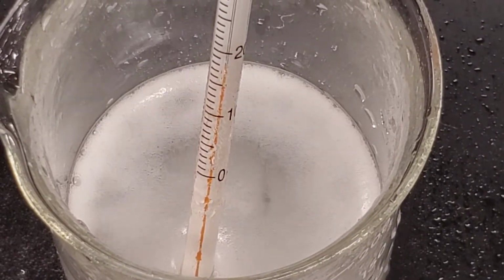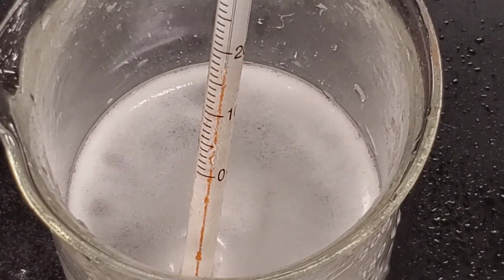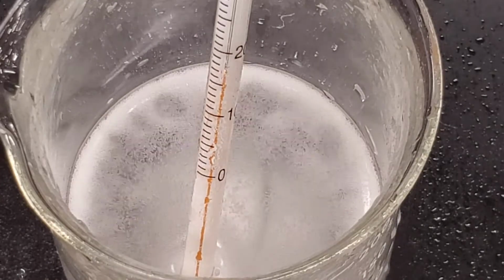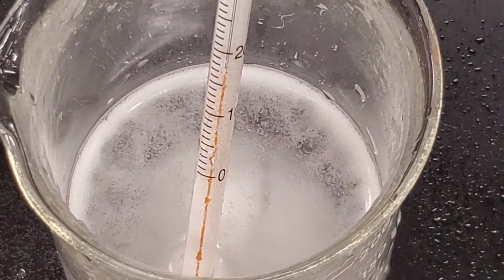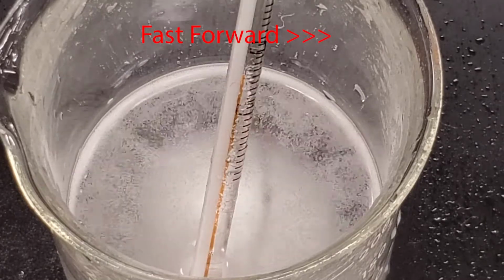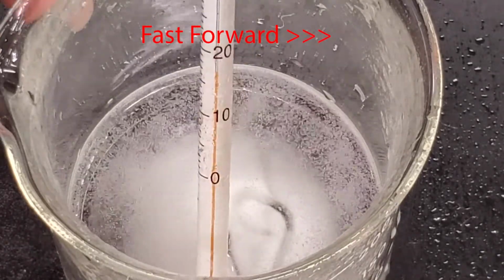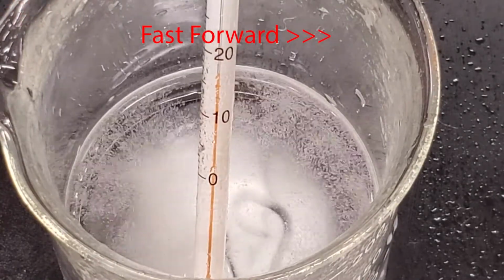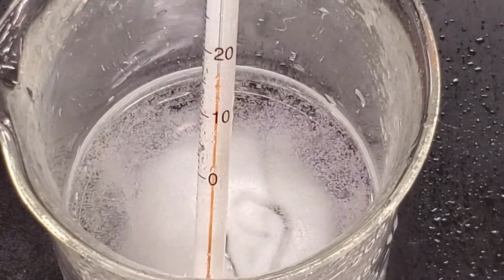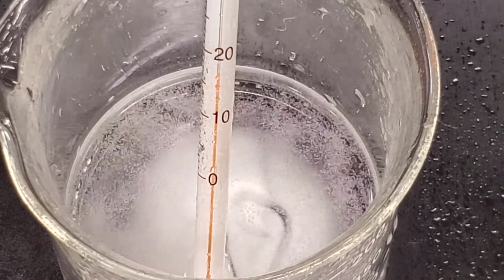Make sure you're paying attention to any reactions or changes that have happened and that you're recording those into your table 1 next to the baking soda and vinegar. We'll give it about 1 more minute here, and then we will take the official ending temperature.